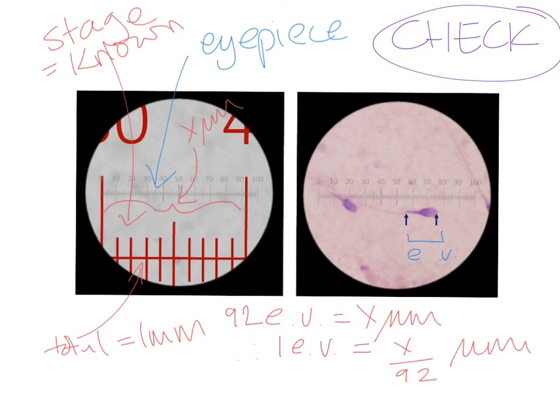So have another go at the question and see if you can work out how long the distance is between those two arrows.